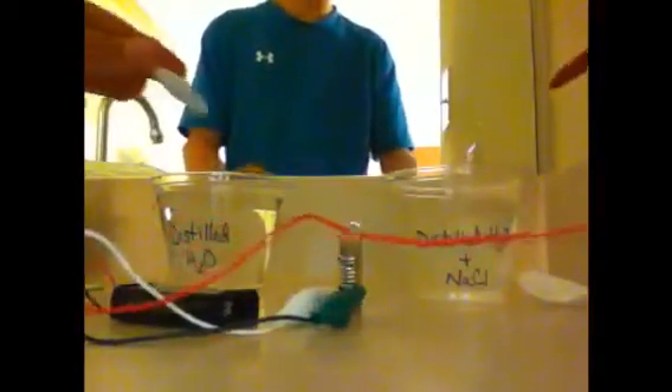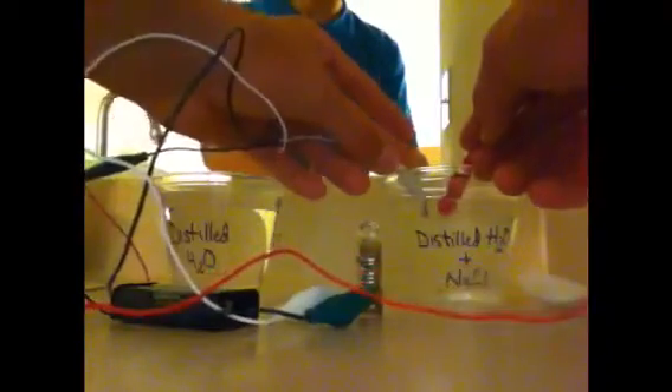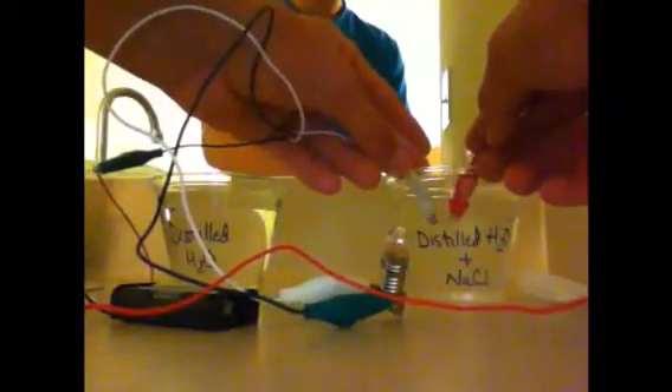Now, if we put the wires together in the salt water, we get a small glow.